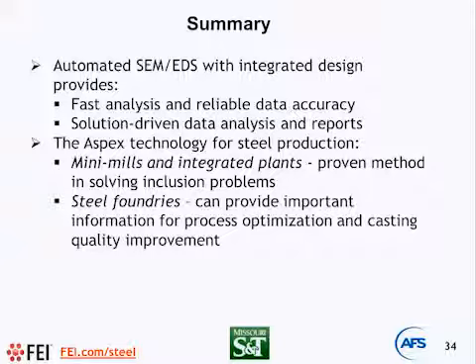Very good. I have another question that came in. The analysis discussed applies to mounted and polished samples, which represent very little surface area of the steel heat, usually in a range of 10 to 50 tons. Do you think such type of analysis would be possible to be applied in the future as part of 3D X-ray tomography, which could be used for 100% of the steel volume as part of the final inspection process?